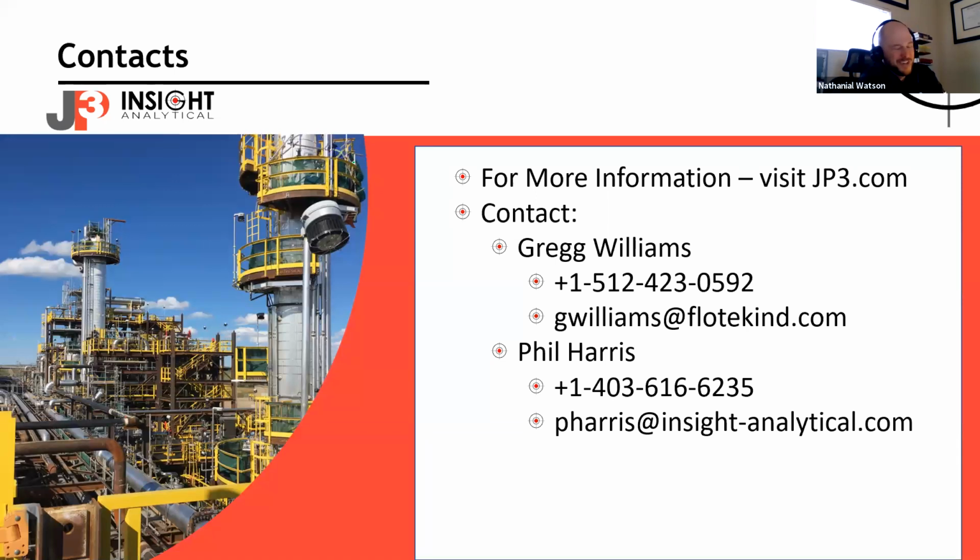That's not so much intellectual property as data I have stored in a database. In terms of modeling, principal components analysis and partial least squares have been around for a long time. Even if there ever was a patent on them, it's expired, and I don't think you could patent those if you wanted to. I hope that answers it.